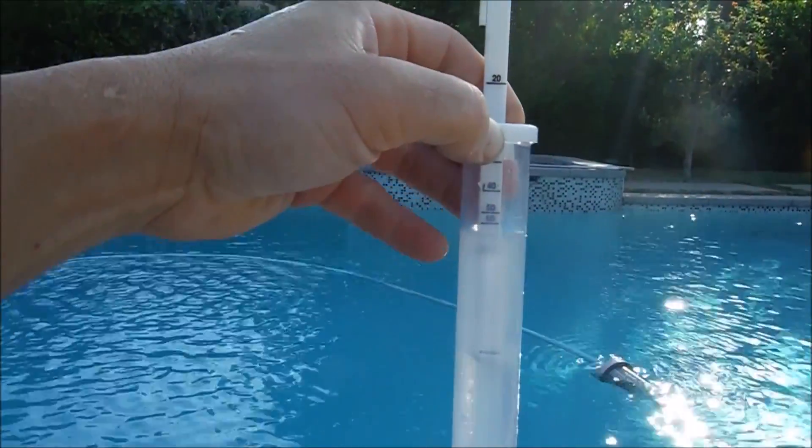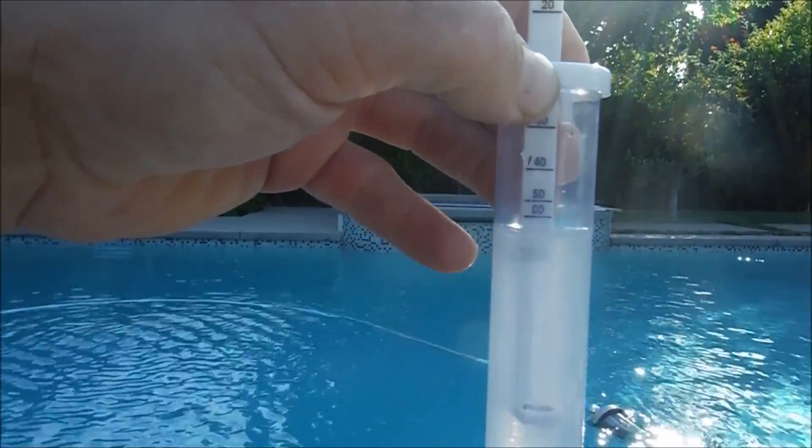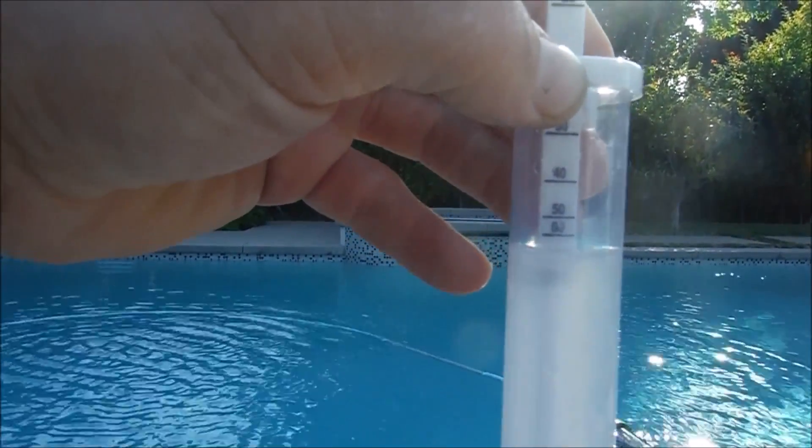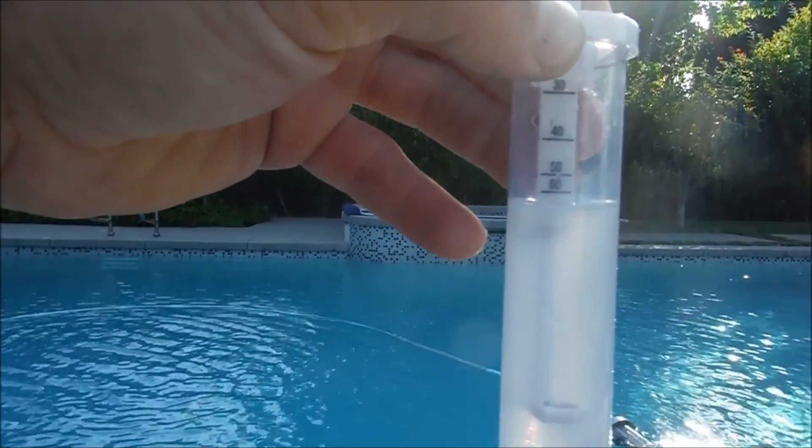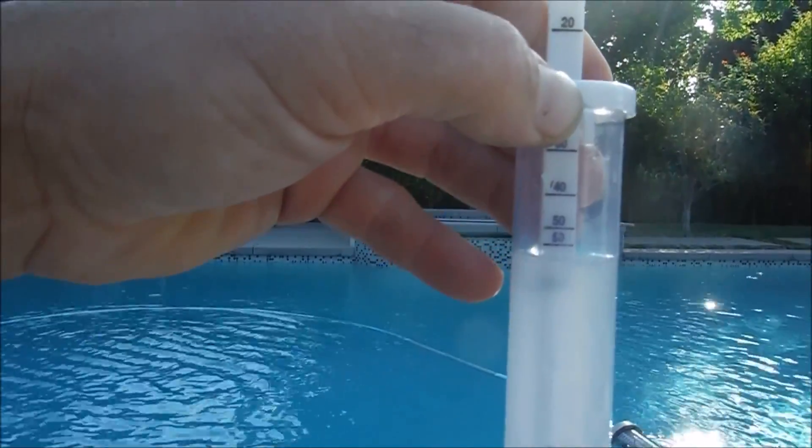Once that black dot disappears you want to look through the tester here. Look at the water level inside the tester and look at that number straight across on the water level. You can see that it's about 70. It only goes from 60 to 100. You have to kind of guess here. I'm going to say it's about 70 parts per million.